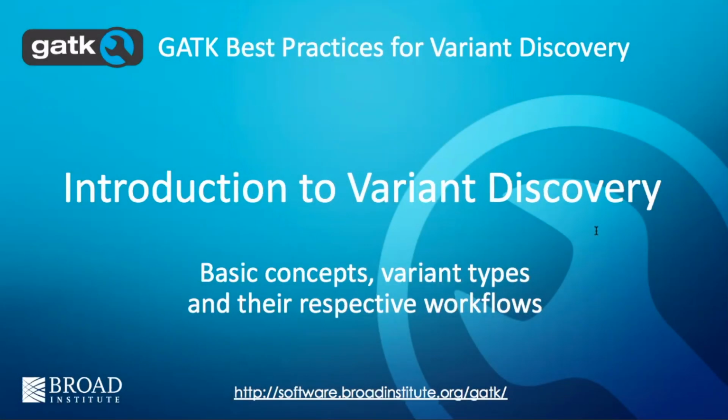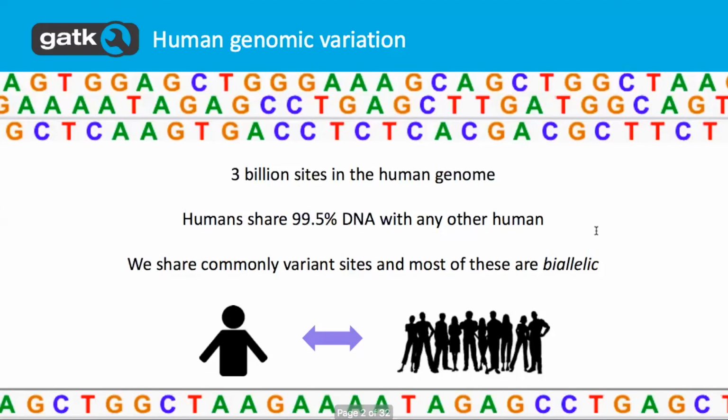Okay, so now we have pre-processed BAMs with aligned reads, the base quality scores are calibrated and the duplicates marked, and we're ready to call some variants. So here we'll just talk about the overall different pipelines we have for calling different types of variants and the actual output formats that the variant callers will give us.